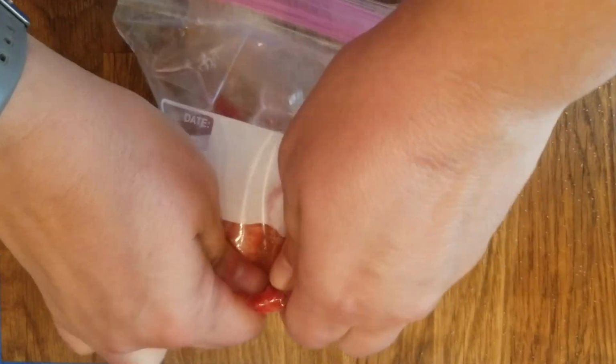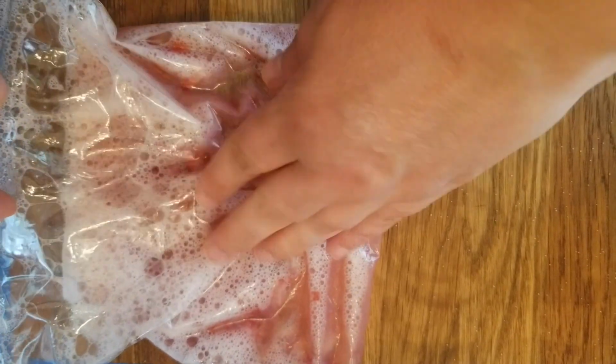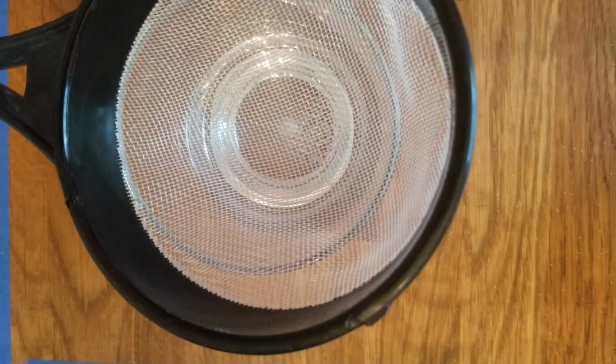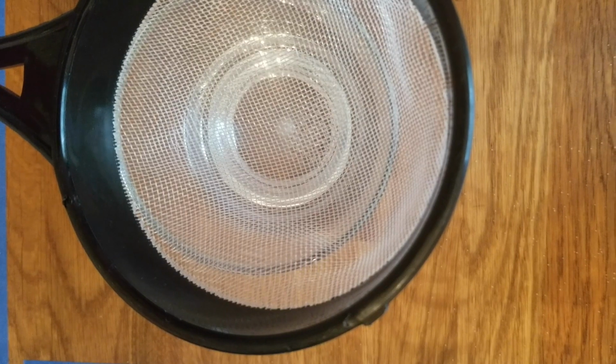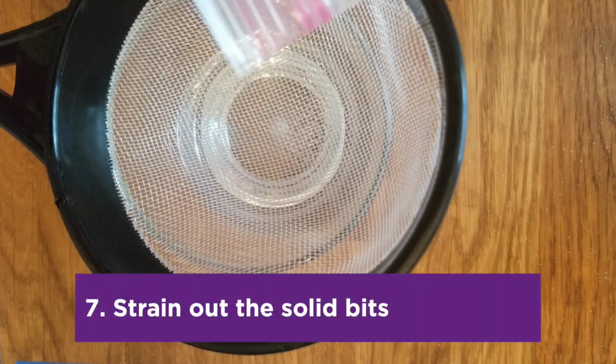And you want to try to get all of the chunks out. And you're just going to keep squishing and squishing and squishing. Once you've squished up all your berries, you should notice your extraction liquid has turned a pink color, just like your strawberries. You're going to want to set that aside and get your strainer and a glass container ready. And you're going to pour this strawberry mixture right into that container.